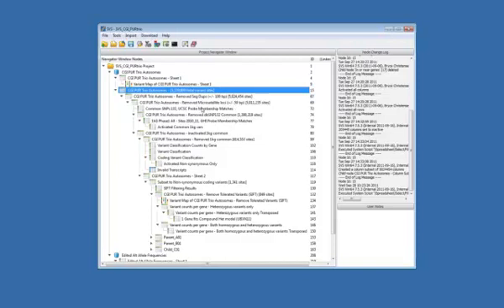I then took a second step of removing any markers that were in or near a microsatellite. Again, segmental duplications microsatellites are known to interfere with appropriate alignment. And so that took out about 10,000 more variants.